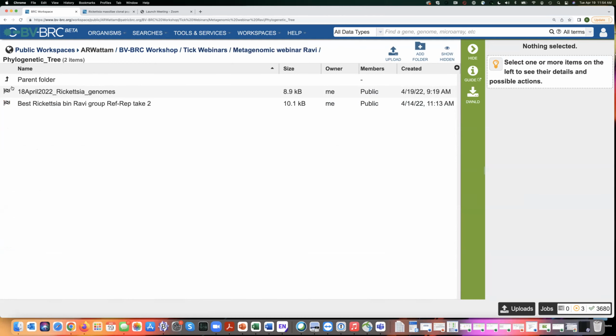Rebecca, quickly, I think I missed this chat a couple of minutes ago, but Claudia was wondering whether the data was from a 16S or from a whole genome. It's whole genomes, shotgun. They have to have been assembled and annotated within the resource. You can't bring in outside data, and it's a requirement that they have to be annotated here because they're drawing on our protein families.